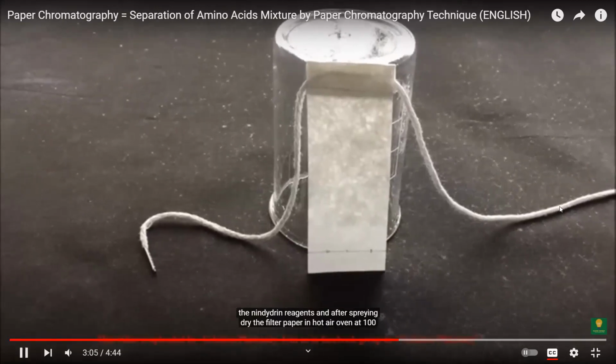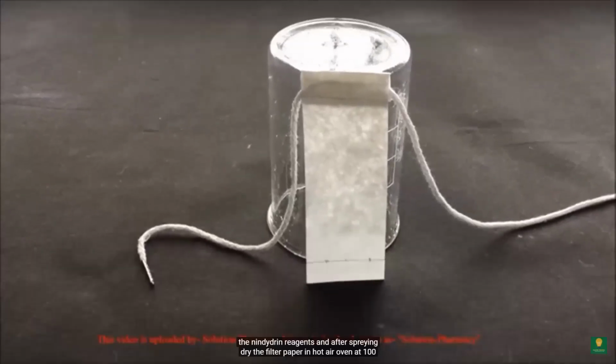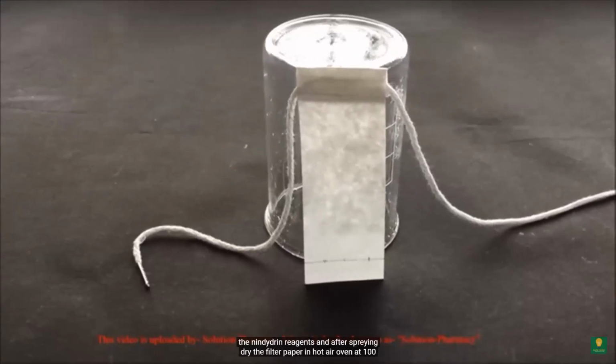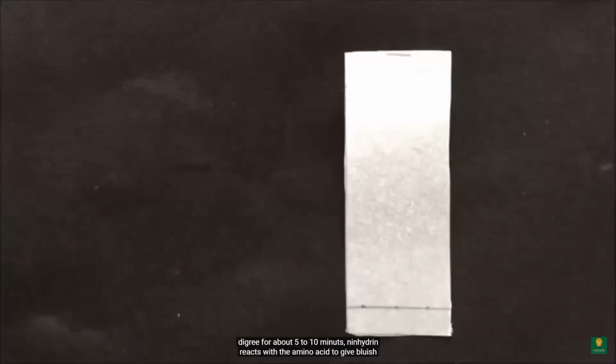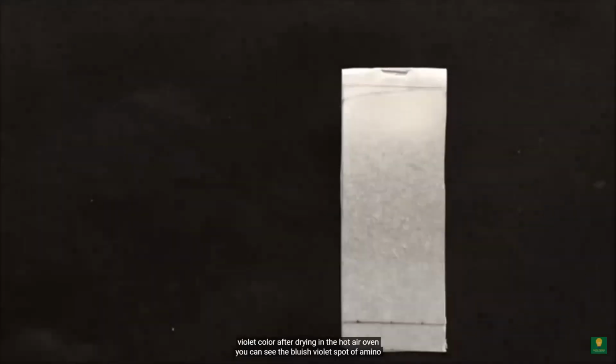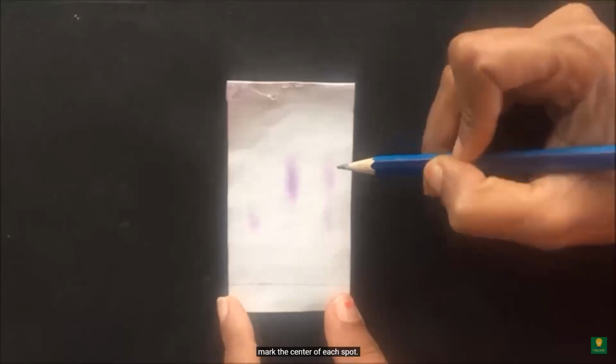With the ninhydrin reagent, and after spraying, dry the filter paper in a hot air oven at 100 degrees Celsius for about 5 to 10 minutes. Ninhydrin reacts with the amino acids to give a bluish violet color. After drying in the hot air oven, you can see the bluish violet spots of amino acids. After this, outline each spot of amino acids on the filter paper with a pencil and mark the center of each spot.